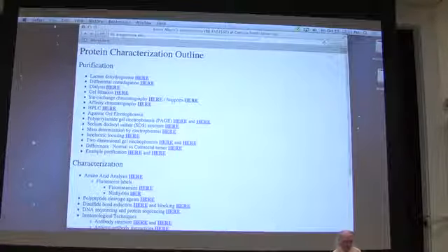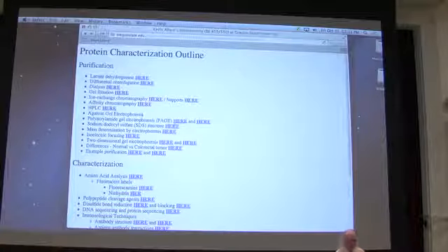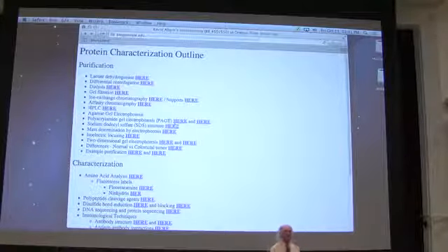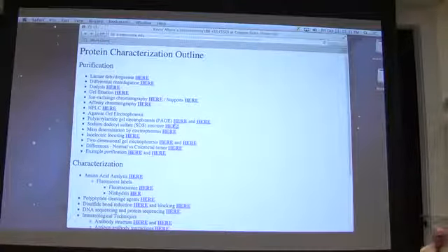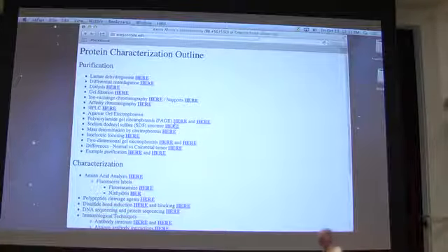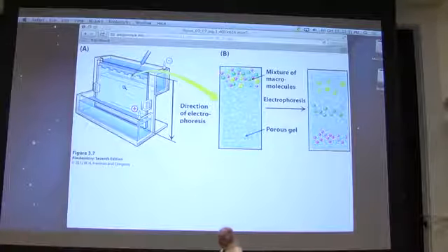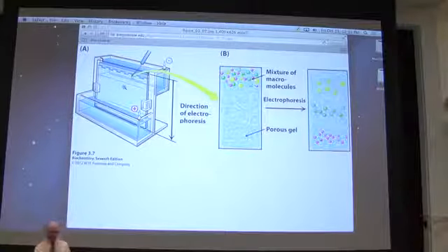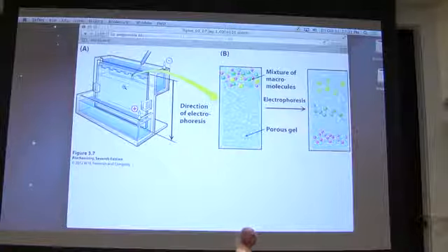Okay, let's turn our attention to agarose gel electrophoresis first before I talk about polyacrylamide gel. How many people run agarose gel? Okay, good. Boy, that's really good to see so many hands going up. Agarose gel electrophoresis is one I don't have a good figure for, but I can tell you about it. I'll show you what an agarose gel might look like. Polyacrylamide gels schematically look exactly the same. Although agarose gel sometimes can be done horizontally as a slab instead of vertically, although you can also do vertical agarose gels.